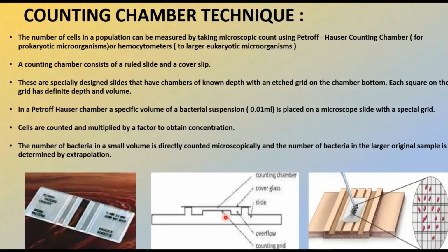That means this counting chamber is constructed in such a manner that the cover slip, this is a slide, and the ruled lines determine a known volume. That means these Neubauer chambers or Petroff-Hausser chambers.